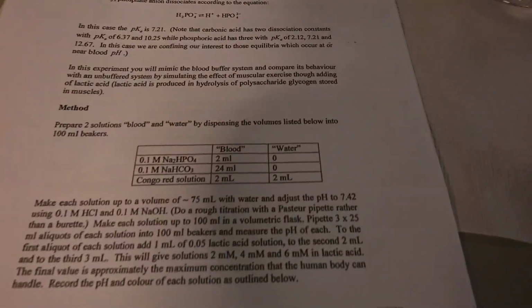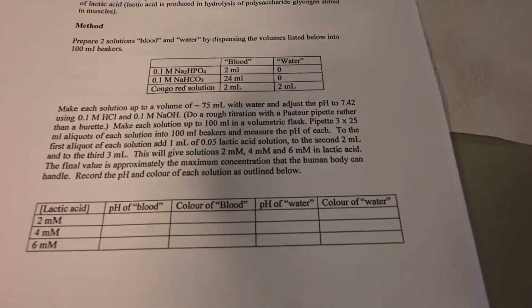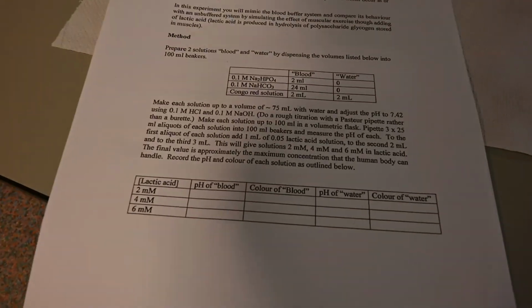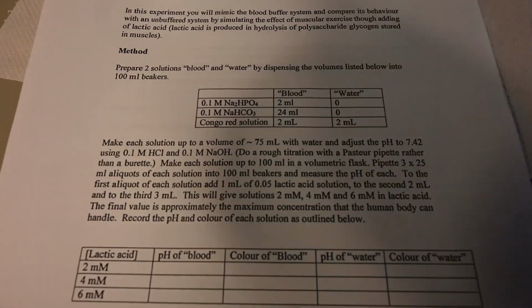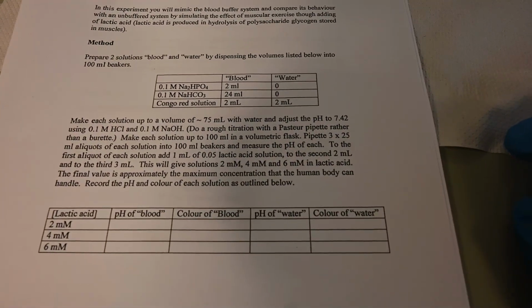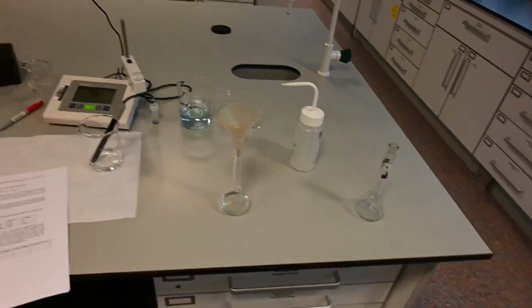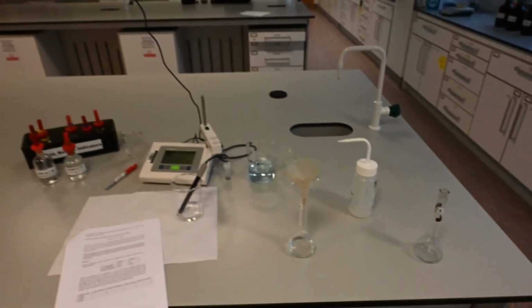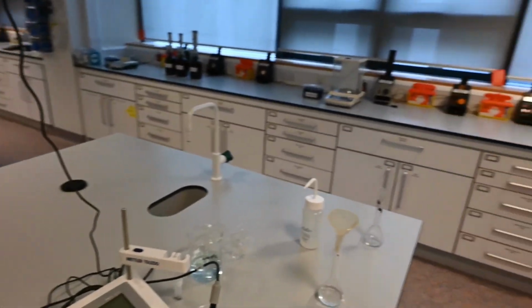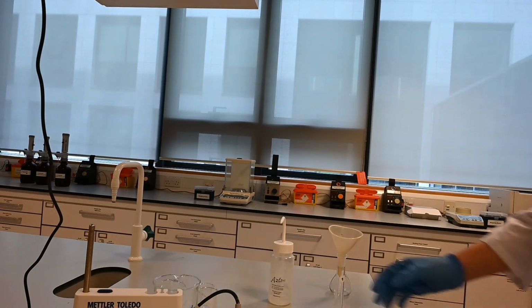So if you can see here, it says make each solution up to a volume of around 75 milliliters with water. But for any mathematicians doing this module, if you add 2 plus 24 plus 2, that's 28 plus 75. That's going to be over 100 milliliters, even though it wants you to have each solution up to 100 milliliters. So in order for us to get each solution up to 100 milliliters, instead of using 75 milliliters of water for the blood solution, we're going to be using around 60 milliliters of water.